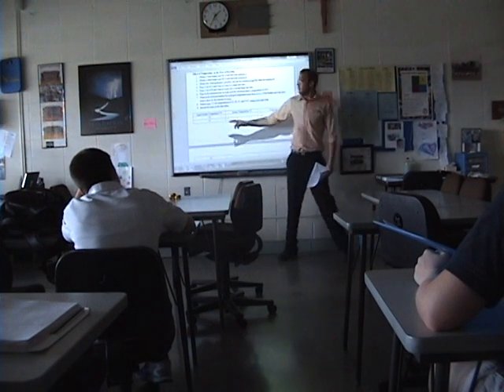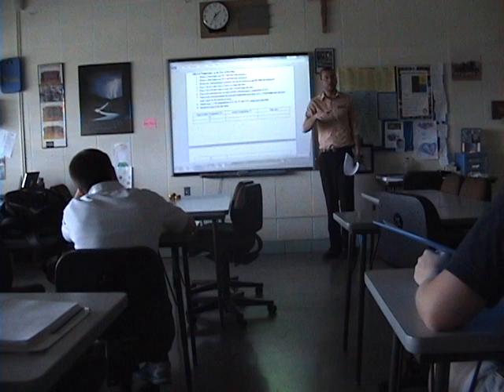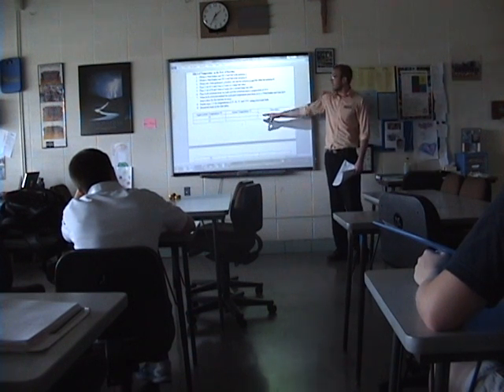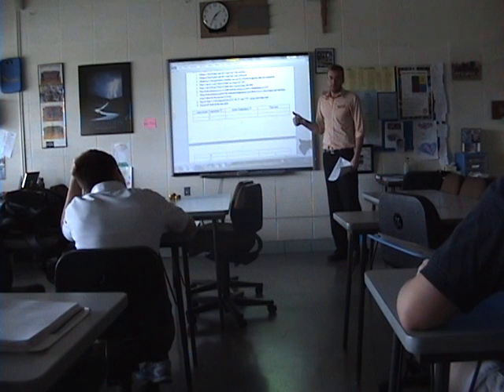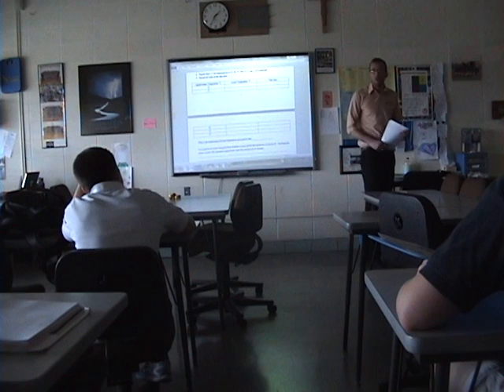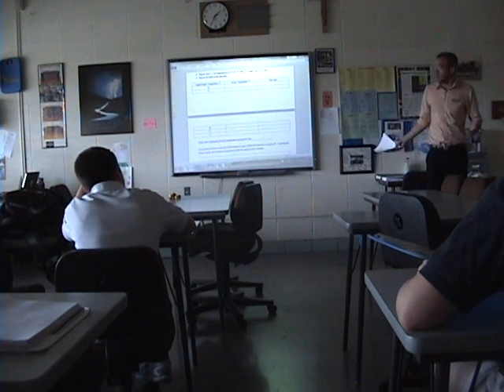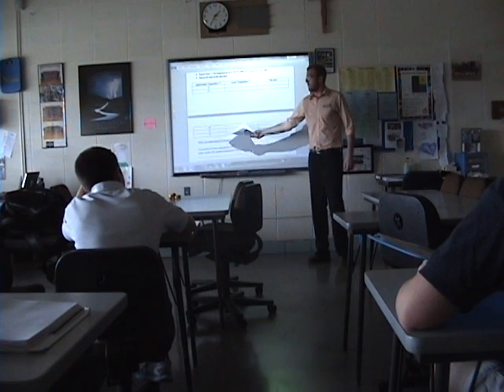And then for the second one, you're actually not going to do 25 in your room temperature. So whatever room temperature is, it's going to be around 22, 23 degrees Celsius. You can actually write that here. And again, because it's hotter, the rate's going to go up. So pretty straightforward. You can start your hot bath as soon as you want. That's going to be for your 40, 55, and 75.